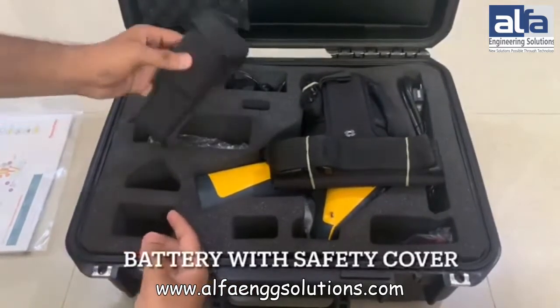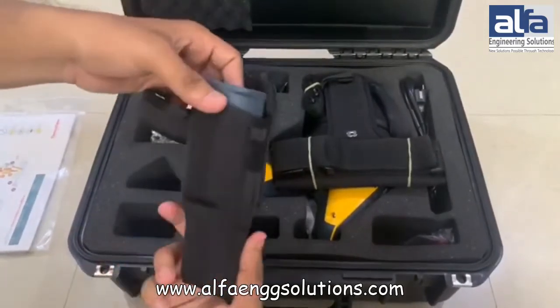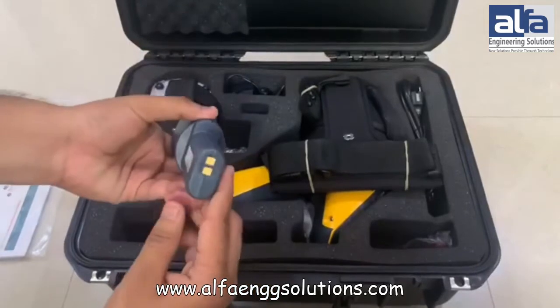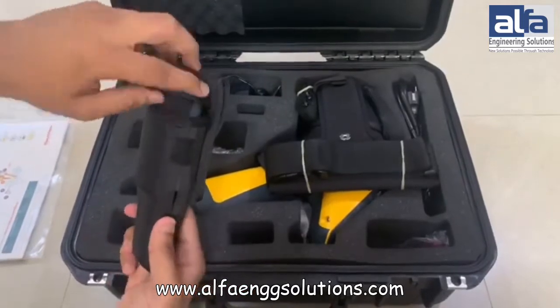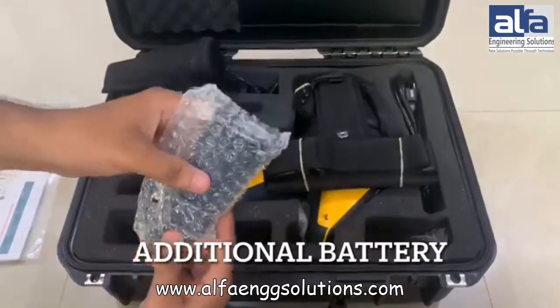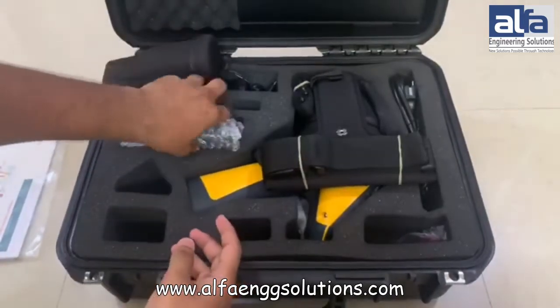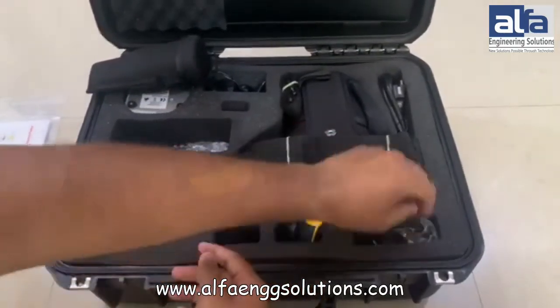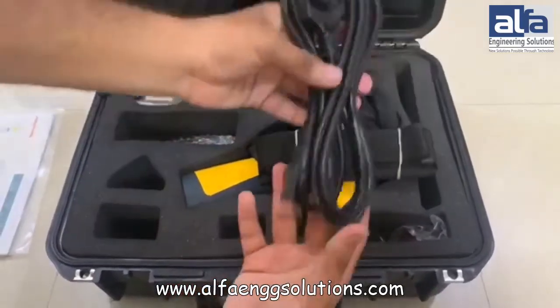This is the battery, which is placed inside the safety cover. In the Thermo Fisher Niton XL200G you will get an extra battery. This is the power cable which is used to attach with the power adapter to charge the batteries.